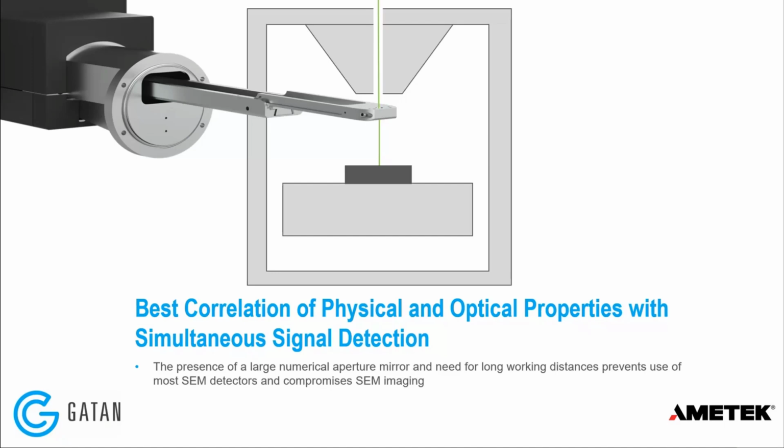Now, you've already seen that we use a collection mirror to collect a very large proportion of the photons that are emitted from a sample. And in fact, the solid angle of that collection mirror is something like 1.4 pi steradian. So we collect about 80% of the visible photons emitted from a sample, assuming it's a Lambertian emitter.